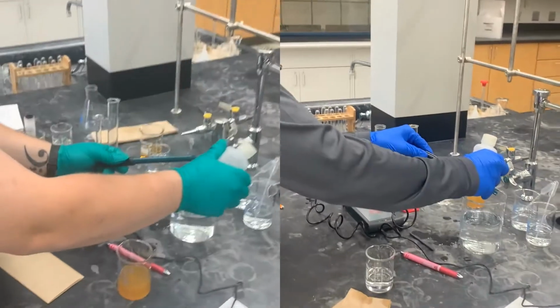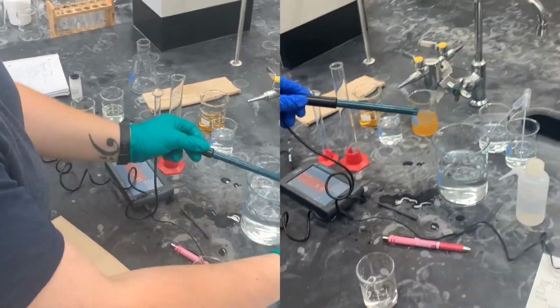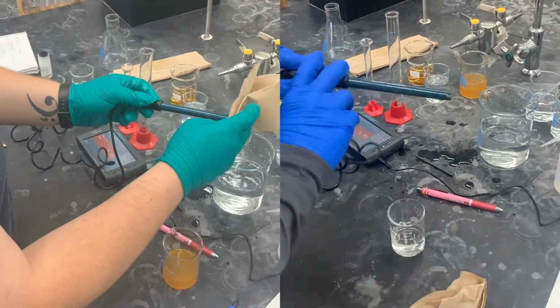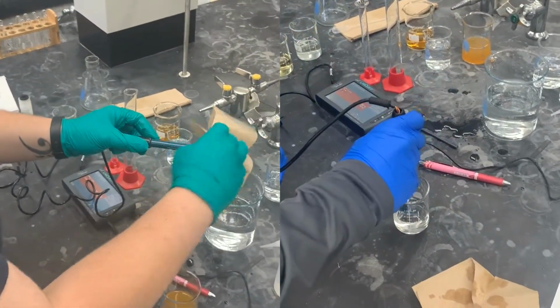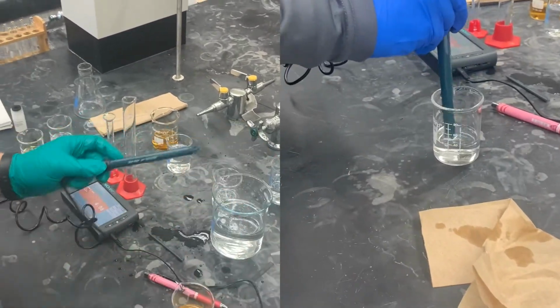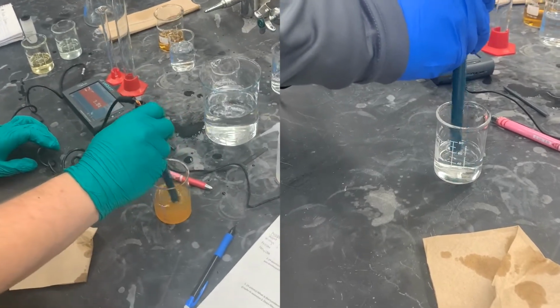In the video, you see our group calibrating the pH meter with buffer solutions of 4 and 7, which allow us to accurately measure the pH of our unknown acid. We started with our pH 7 buffer, stirring the rod in the solution and entering 7 into our meter. We then clean the rod with our distilled water and repeat with our pH 4 buffer.